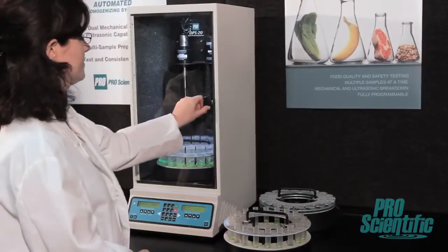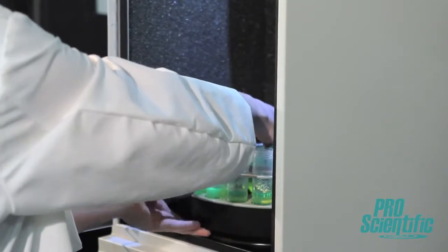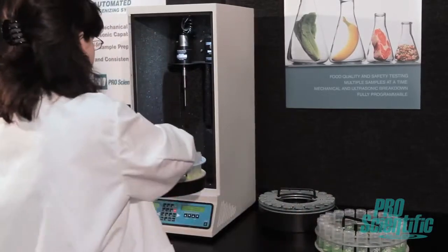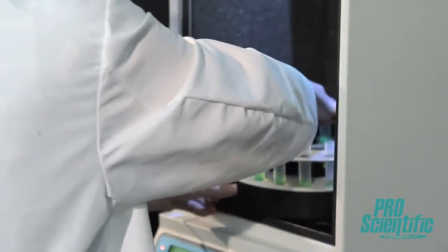High throughput is easily achieved when using the DPS20. With it, you can efficiently process up to 20 samples in one run that lasts mere minutes. Additional carousel trays can be purchased for standby and are easily loaded and unloaded. And when cross-contamination is a concern, you have the option of adding a shared rinse or unique rinse after each sample run.